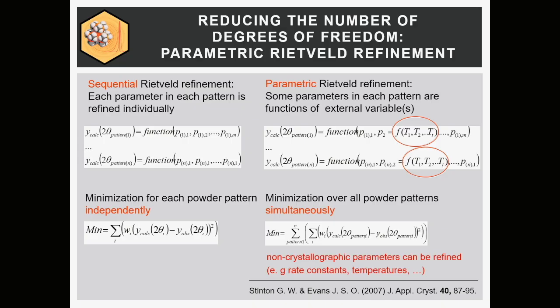We will not do this during the course, but one of the powers of powder diffraction, of course, of Rietveld, is that we can refine many Rietveld patterns at once, which is absolutely cool. When we go home from the synchrotron, we maybe have 500 powder patterns, let's say a simple temperature series. And now you can say, okay, who is the PhD student I don't like at all? This guy, you do the 500 powder patterns until next week. And then he's sitting, doing one by one by one. It's terrible. This is something a computer can do.